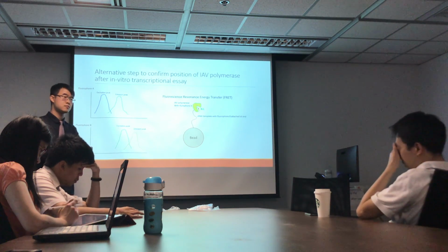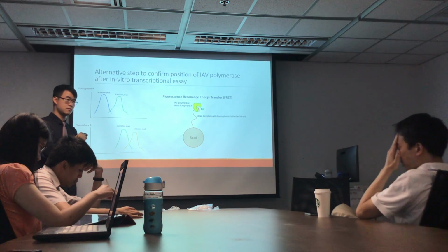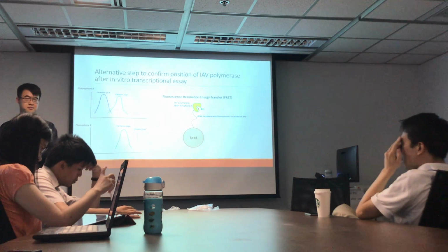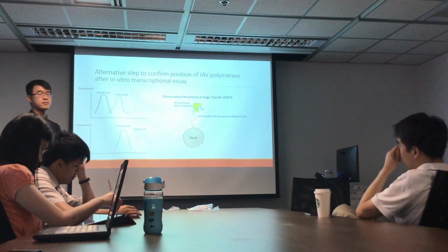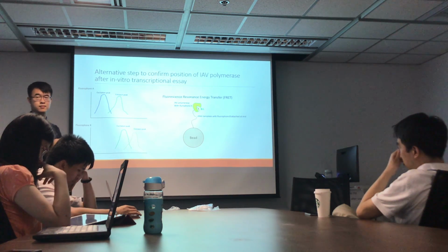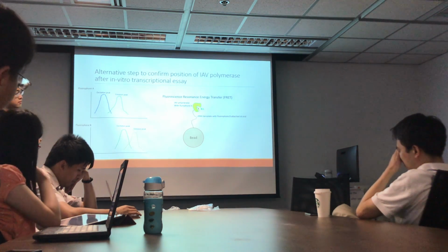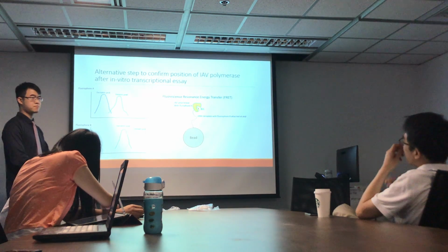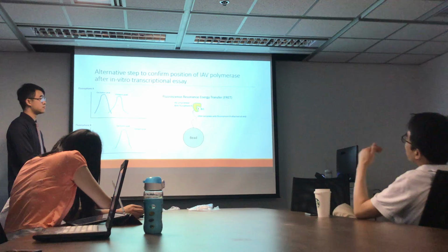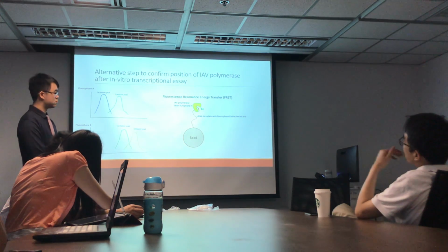No, these are talking about stop flow, right? You're talking about stop flow? I think the idea is the same. Okay, so you want to use this as a stop flow. So yeah, when the two reagents meet and you incubate some time to see how. But then your detector is at the end, right? What if the reaction is halfway, then you won't be able to see anything?